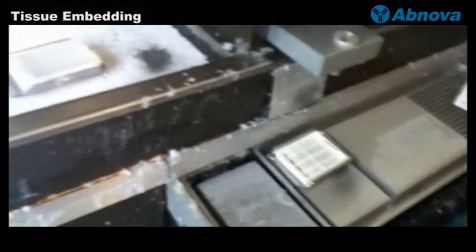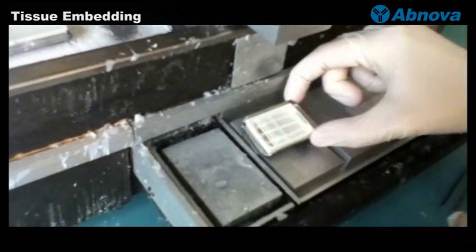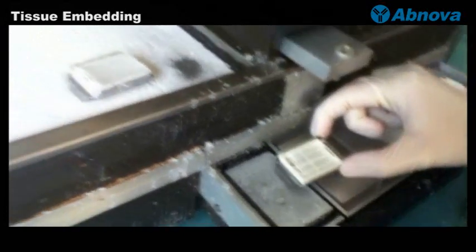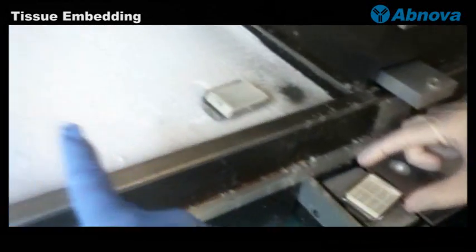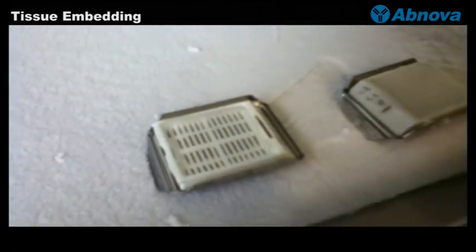After this, you put the whole cassette to the cold surface to solidify the whole block. And that will be it.